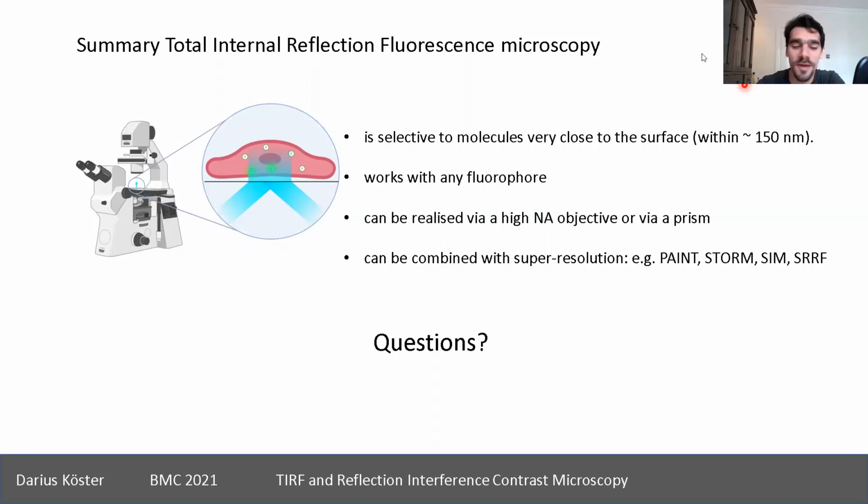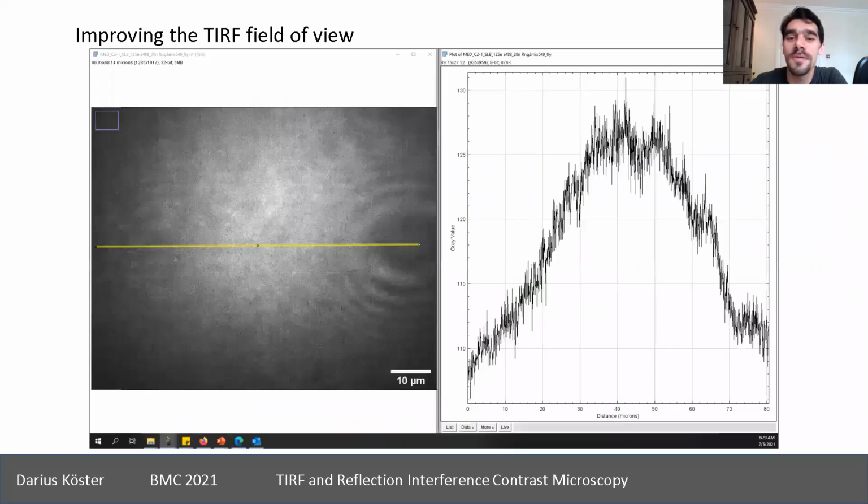Those are really good points. For the second one, before the talk started, I thought I should have maybe prepared something, but I think I can somehow draw something. Anyway, for the first question, which is how do I confirm that I'm in TIRF, with the angle. One way is plainly how I showed you in the video. You have to look what happens to your laser. So let me just go back. How can I see the other slides?